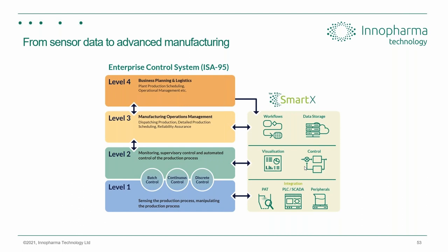in an analytical lab, a lot like this, with other analytical techniques, where we just look at the quality of our end product. We form a picture of what a perfect process looks like by judging the quality of those end products using a full suite of analytical techniques. This means that at this level we can develop workflows that tie in not just with the quality of the end products, but with availability, with inventory, with stock management, and so on. So that brings us all the way up to enterprise level.